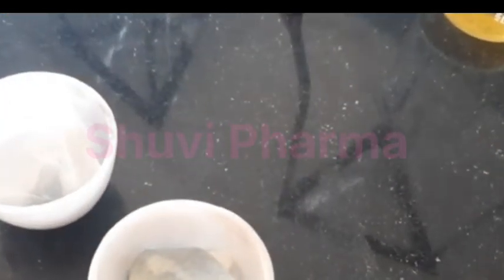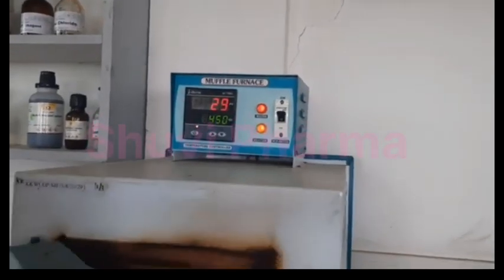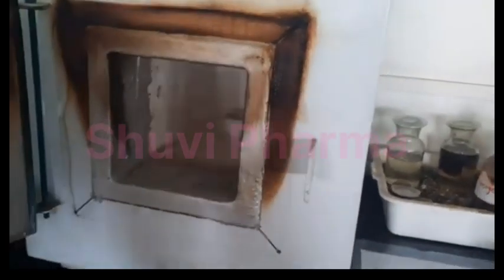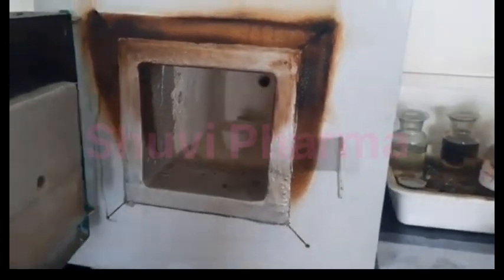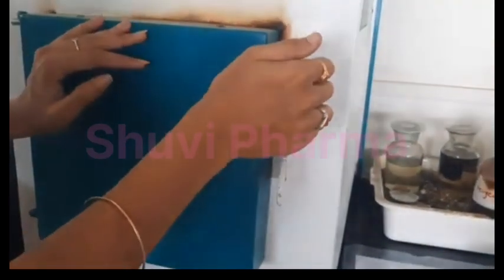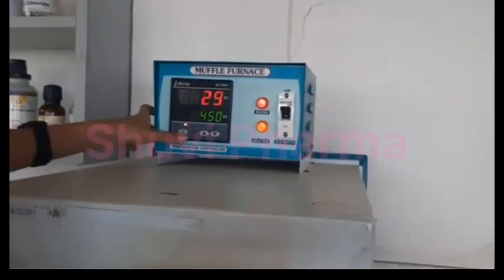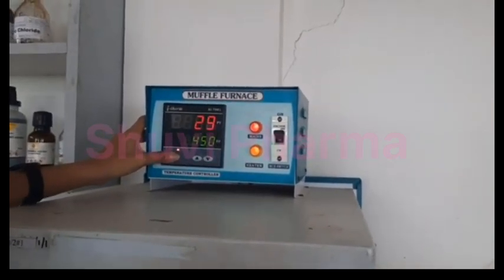Now we will incinerate both the crucibles at 450 degrees Celsius in muffle furnace for 6 hours. Set the temperature to 450 and then place these crucibles into the furnace. So I have placed first crucible of acid insoluble, second of water soluble. And then we will start the muffle furnace. So after 6 hours, we will note down the weight of the crucibles.